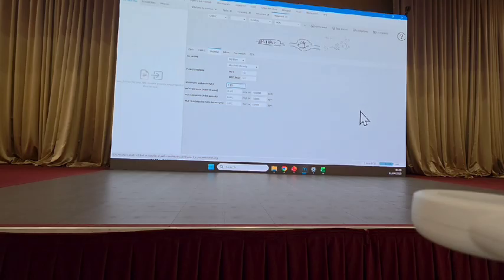That will give you a really good idea what settings you should use for these heights, and this is also true for any retention time shift or mass tolerance, which is next.